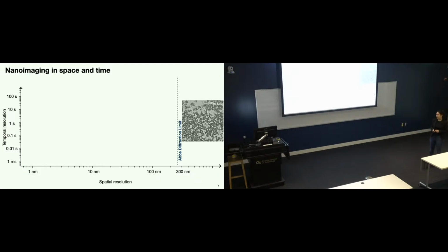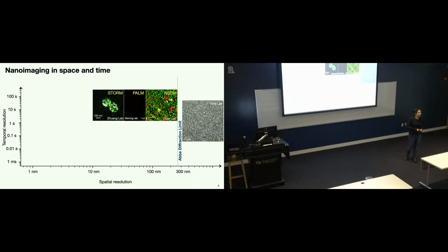And then there were, of course, advancements in microscopy, coming up with super resolution microscopy, which got the Nobel Prize in chemistry. The entire principle of these methods is that you have fluorescently tagged particles or nanomaterials in general, or it could be biological materials, and you are exciting them with a laser. But you can, for example, in the case of STORM, do this stochastically so that you can resolve structures that are very close to each other.